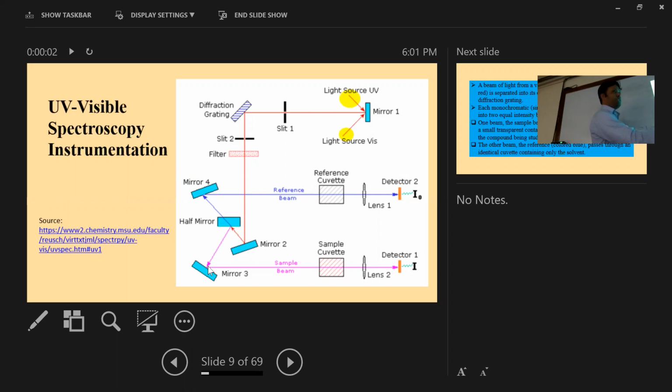Here we should have 50% if we do not have the mango juice. If we have the water, maybe 1% reduces, so we should have 49% here and 49% here. If we have something here that can absorb the light, that will reduce the intensity. So we are getting 50% out of here and 50% out of here; this is the reference.